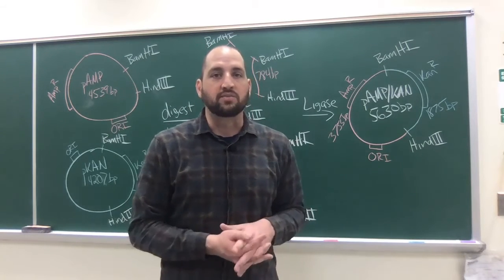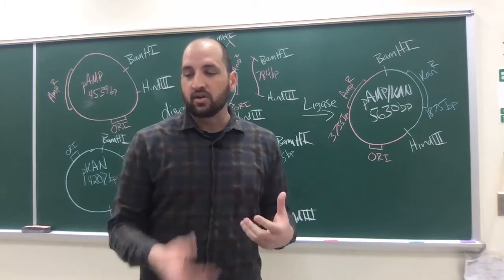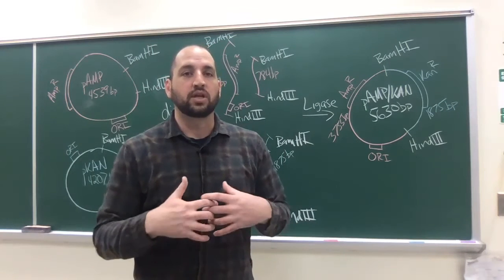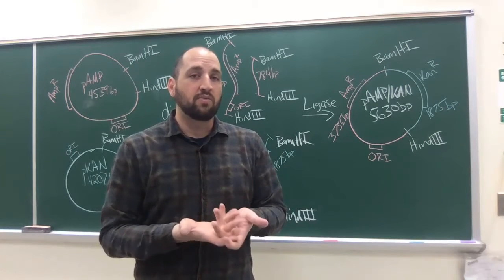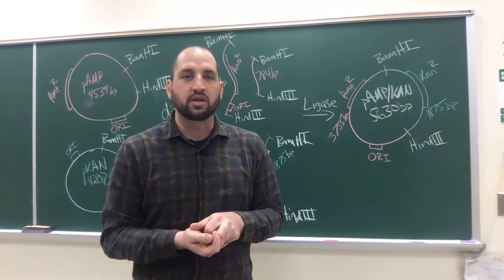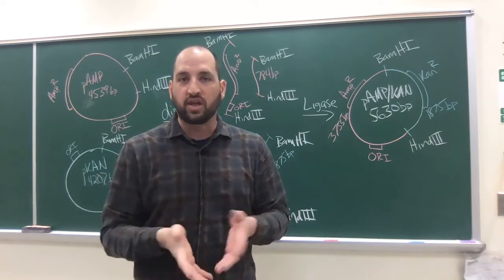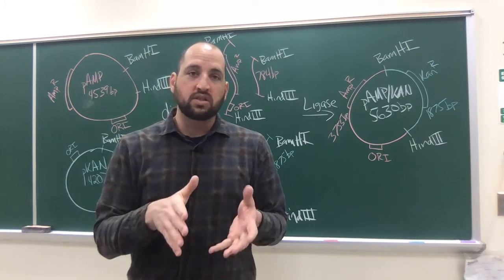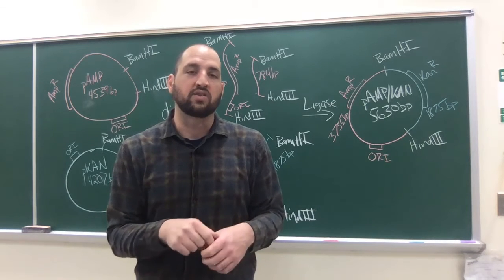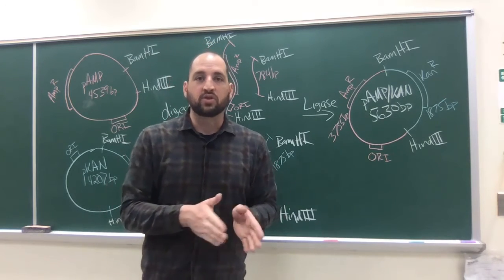At the beginning of this lab, you would come in and there would be cells that are growing. They're happy, healthy cells. There's plenty of nutrients available, and they're in the process of expanding. We call this the mid-log phase of growth. We'll talk a little bit more about that in lecture, but the idea is we're catching them before they start to hit a high level of density. So they're happy, healthy, reproductive. What you would do is aseptically transfer cells. Using sterile technique, you would transfer cells out of that culture where they're in the mid-log state, and transfer them to a tube.